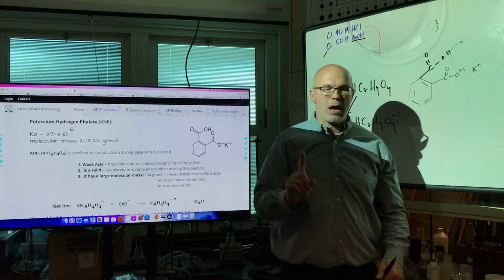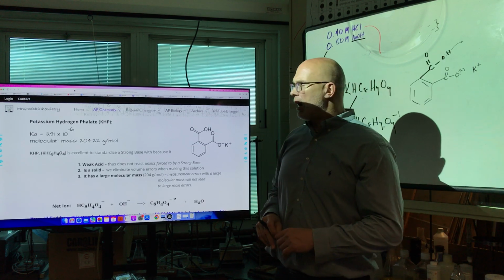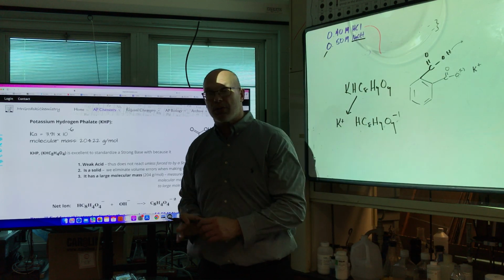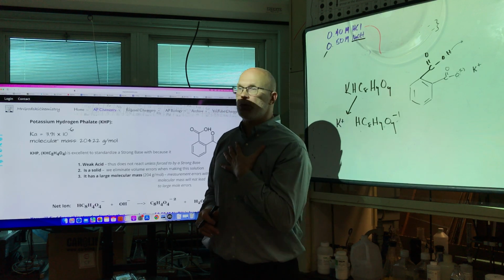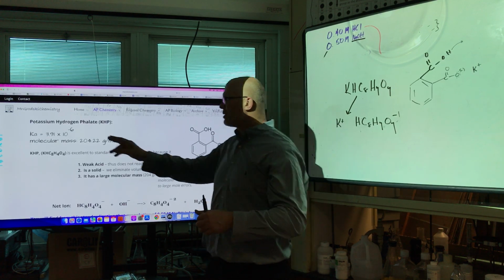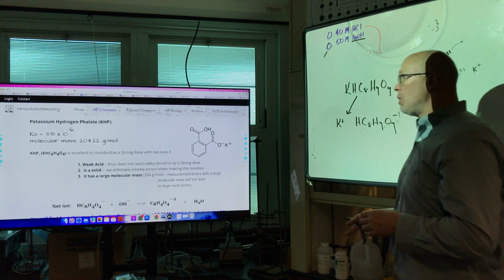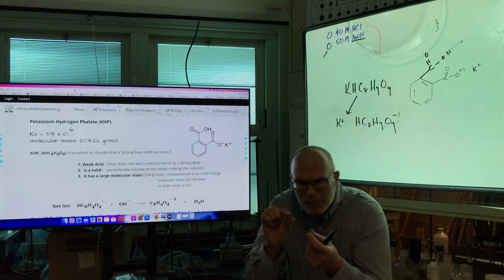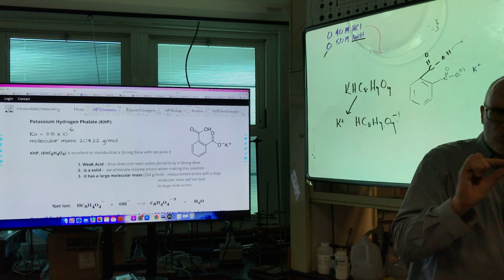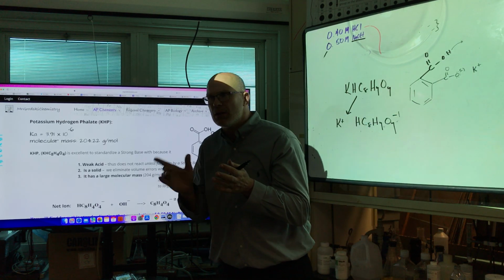I'm going to use KHP to standardize my base solution. I'm going to know the moles of KHP. There's a reason why KHP is beautiful to work with. Number one, it's a weak acid. Do you think it's going to react with anything in the air? No. Number two, it's not a solution. There are no drips to make sure I got every little drop like I had with HCl. It's a solid.